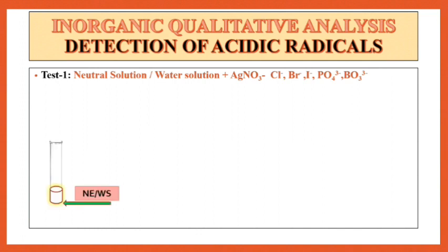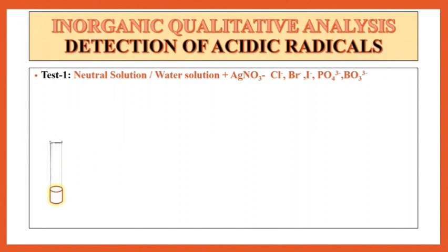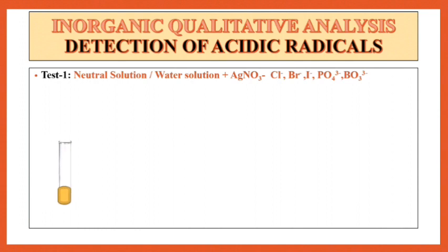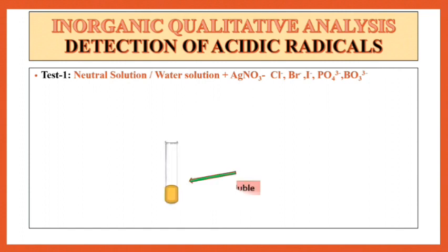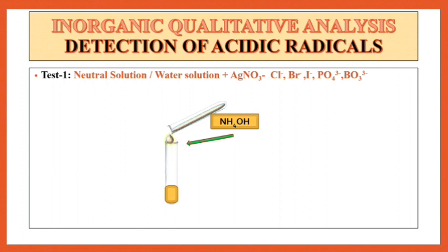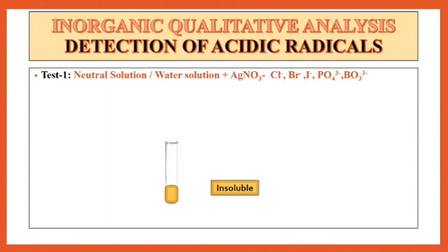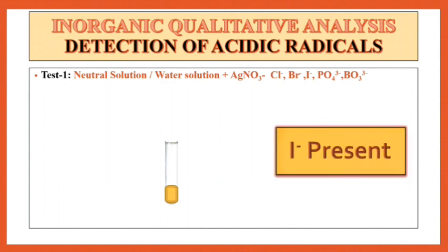Next observation for the addition of AgNO3 solution to the neutral extract or water solution: a yellow PPT is observed. To this yellow PPT, add dilute HNO3 solution drop wise. Shake it well — it is insoluble. To the same solution, add NH4OH solution drop wise. It is insoluble again in NH4OH solution. So I⁻ is present.